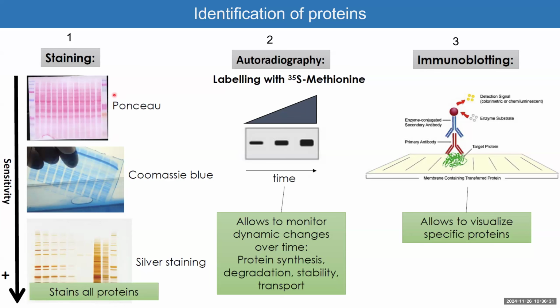When I say the Western blot allows you to check the results in terms of the size and concentration of proteins, this is usually the way it runs from up to down, right? That's where the higher molecular weights are, and we know the molecular weights of these guys. I know them by heart now after years of Western blotting.